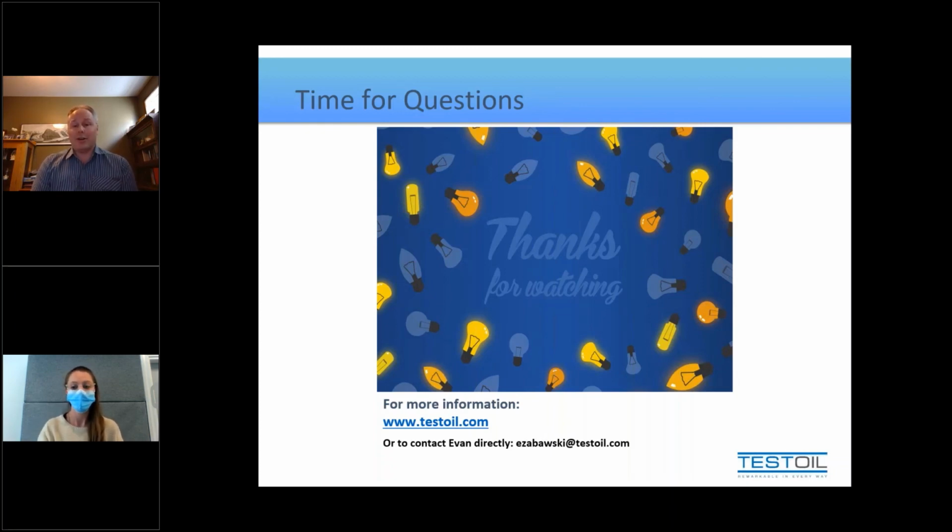And the only other caution I'll give you with NAS, because it's an archaic system, but some people do still use it. NAS is always reported either individually per range, so your 5 to 15 gets its own class, 15 to 25 its own class, and so on, and you just go by the highest class, or it's reported as a single class for the whole particle count, and that is simply which one was the highest.